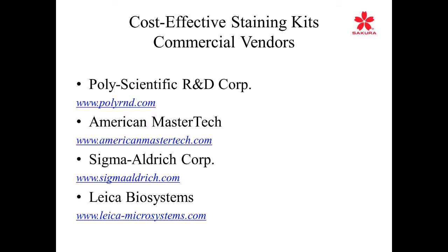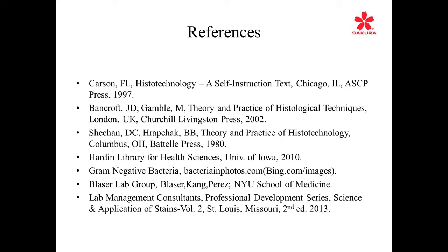So this lecture today has been pretty brief, and I welcome any of you all to look on the NSH schedule, those of you who might be attending next year, or this year in 2014. I have submitted this to be taught as a wet workshop, and it is very informative to follow up the theory that we've just talked about with actually hands-on, because you can actually look under the microscope and see the development of the stain in each step.